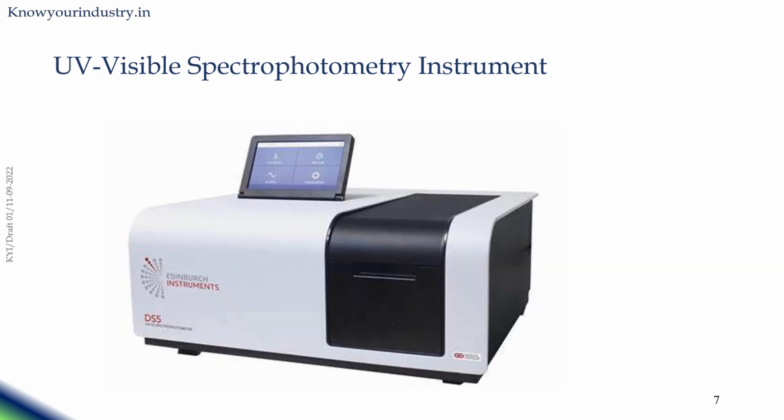In this particular slide, we are seeing an image of a typical UV visible spectrophotometer, which is commonly available in an analytical laboratory or a laboratory in an academic institution. The instrument comprises all the parts we have seen in the previous two slides, like the light source, the monochromator, then the detector, etc. We will generally place the samples in this particular portion.